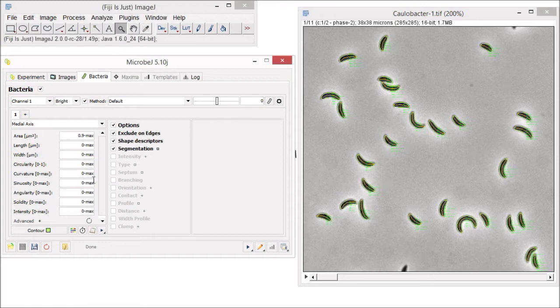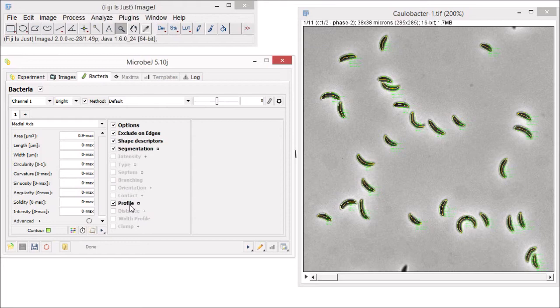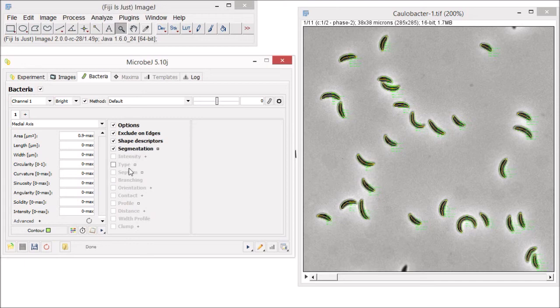Other interesting options that MicrobJ offers are septum detection to detect septa along the medial axis of the cell, or profile when you want to extract the intensity profile along the medial axis of the cell, or to simply get the image of the cell. But we'll talk about those options later.